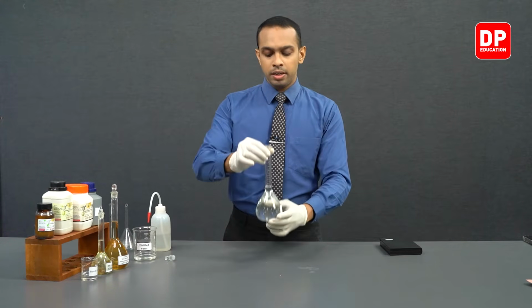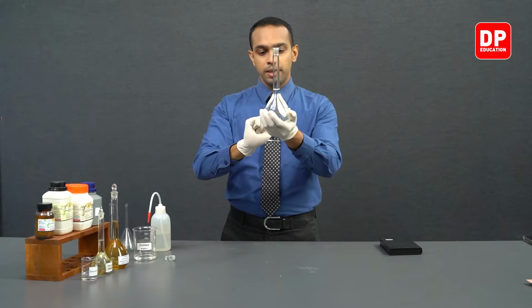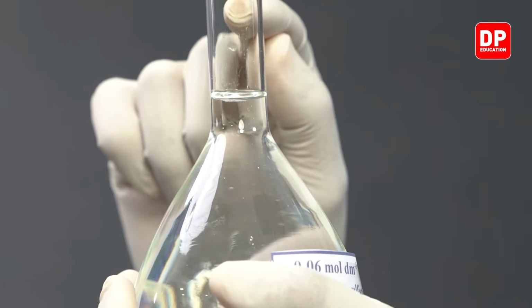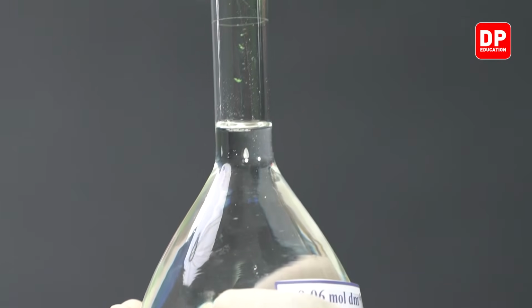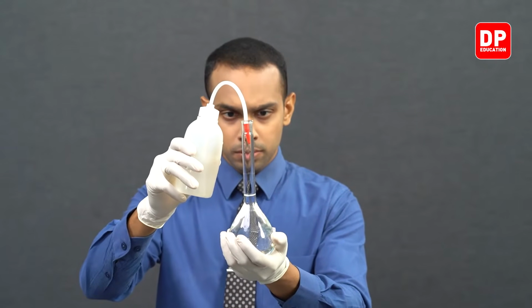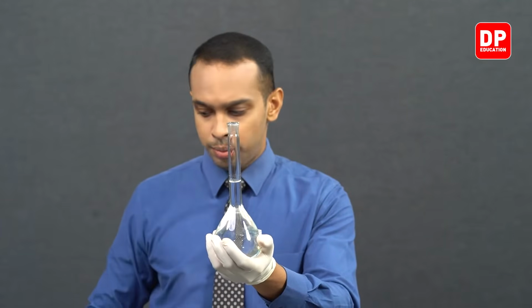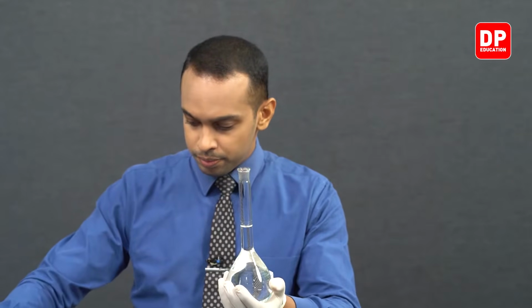Now students, we have added water up to this level in the volumetric flask. We have to add water all the way to this calibration mark. And in order to do that, we can use the wash bottle. But after getting quite close to the calibration mark, we can use a dropper.